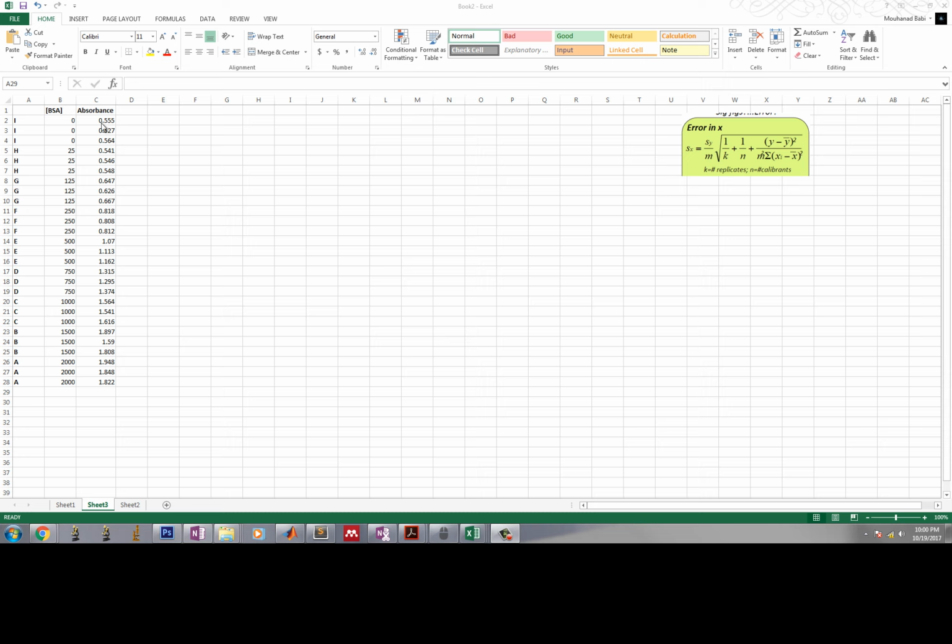Hi guys, in this video tutorial I'm going to show you how to create a calibration curve from your standard measurements, and this is going to be useful for a lot of the labs you're going to do in the future, as well as assignment 2.